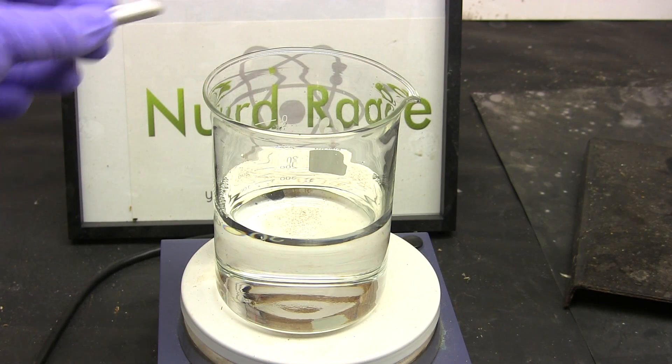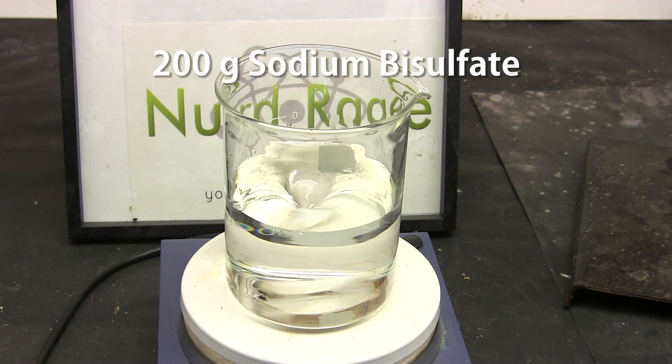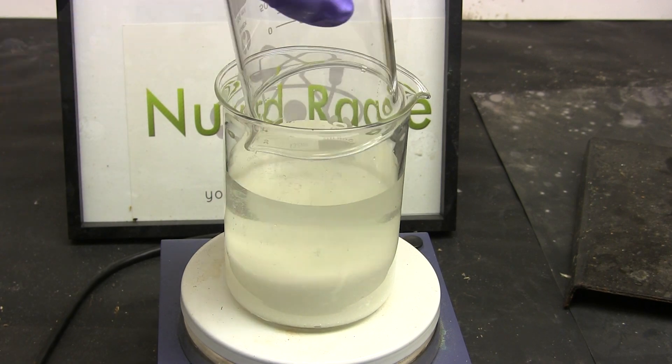Once you have your solution of sodium bromide, add a stir bar and then add 200g of sodium bisulfate. This is sold as a pH-lowering chemical, also for swimming pools.